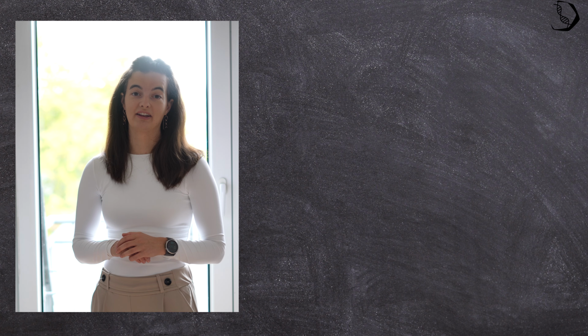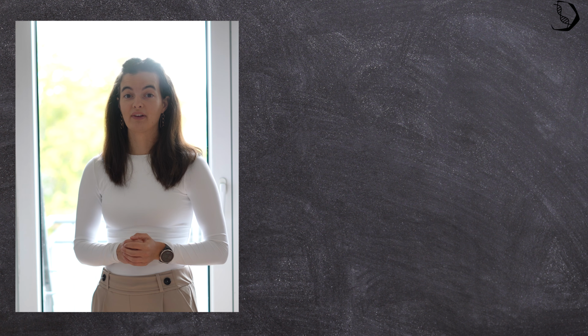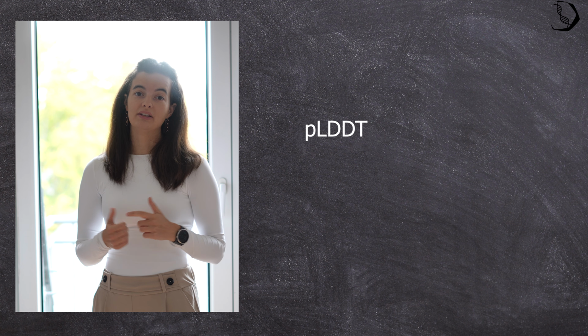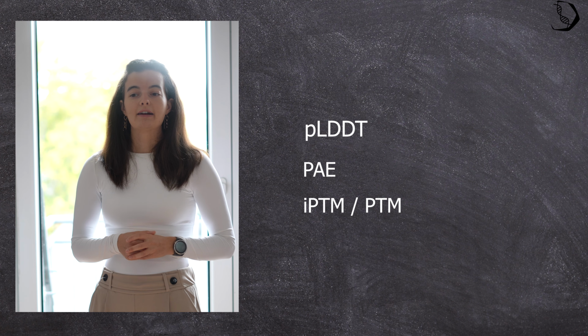In this second video, we will have a look at the AlphaFold server interface today. I will navigate you through it, and then we will have a look at how to submit sequences and different molecules. It doesn't always need to be a protein sequence; it can also be a DNA or RNA sequence, or ions as well. And then I will also carefully explain all the confidence metrics that are necessary for proper predictions, such as the pLDDT or the PAE, also the ipTM score. And yeah, I would say, let's start immediately.